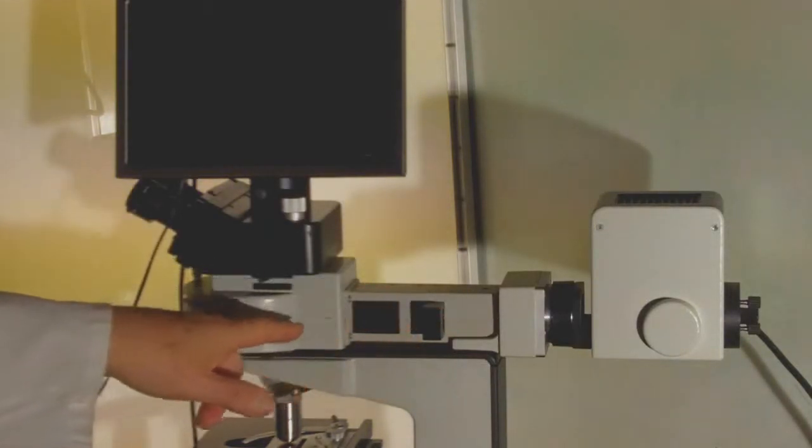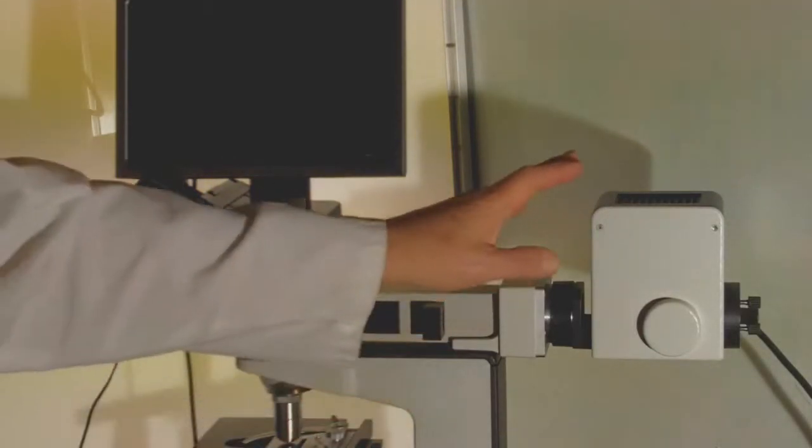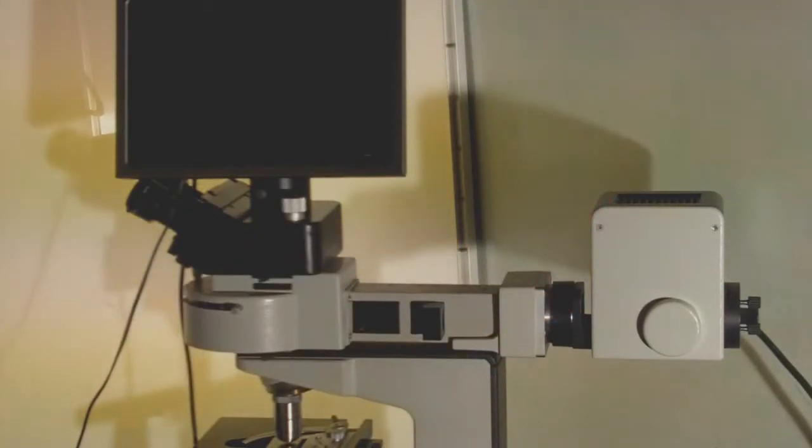Dr. Plume invented the Plume illuminator, as you see here on this older Leitz microscope. But for 50 years we've been using mercury arc, and now that has been replaced in many cases by the LED illuminator.